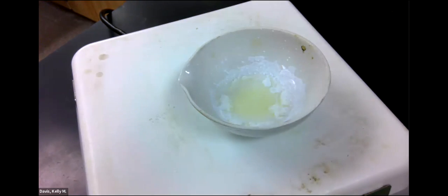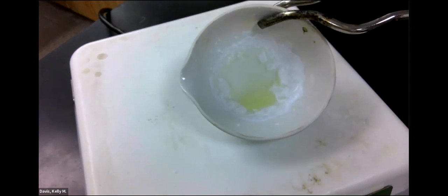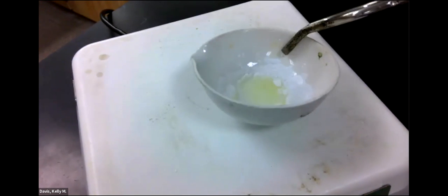See, as it dries out, it looks white and kind of dry around the edges.